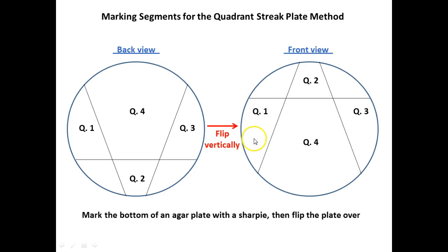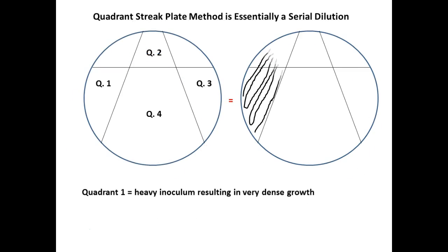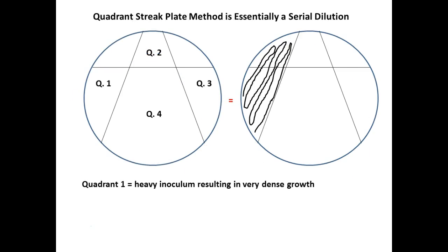So we'll take the organisms from the sample, and we're going to do what I call invisible coloring. We're going to color in. We're going to move our loop gently across the surface and try to color invisibly. You're not going to see anything. That entire section with organism. Then we're going to flame our loop. That removes all the organisms, turns them into ash and minerals, and completely evaporates all the water.